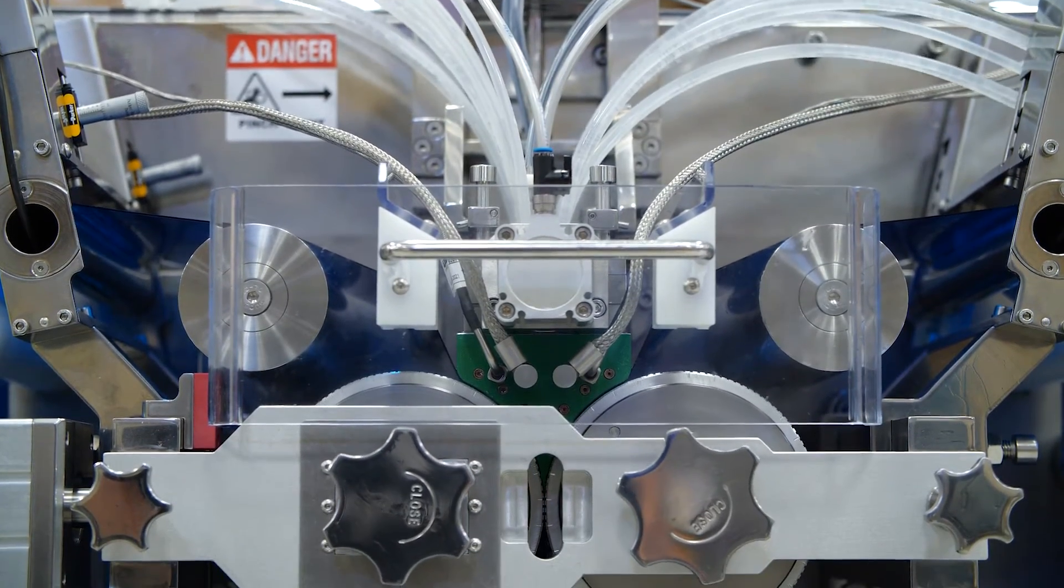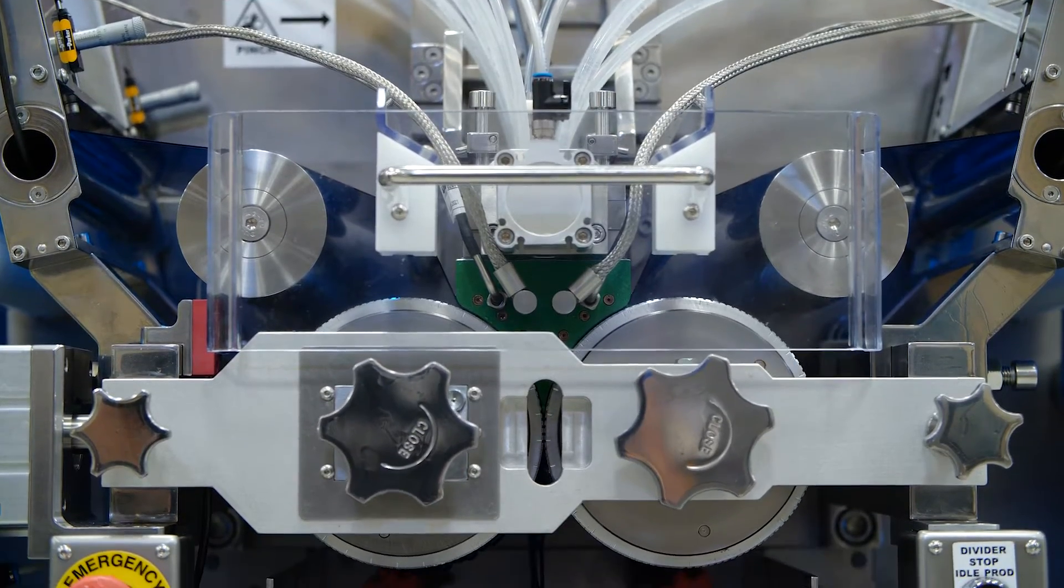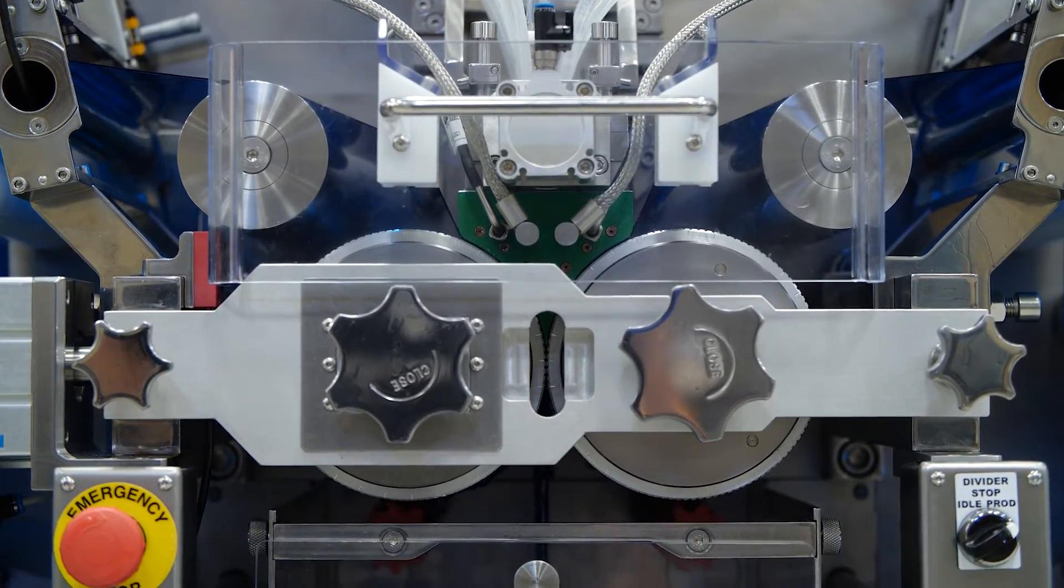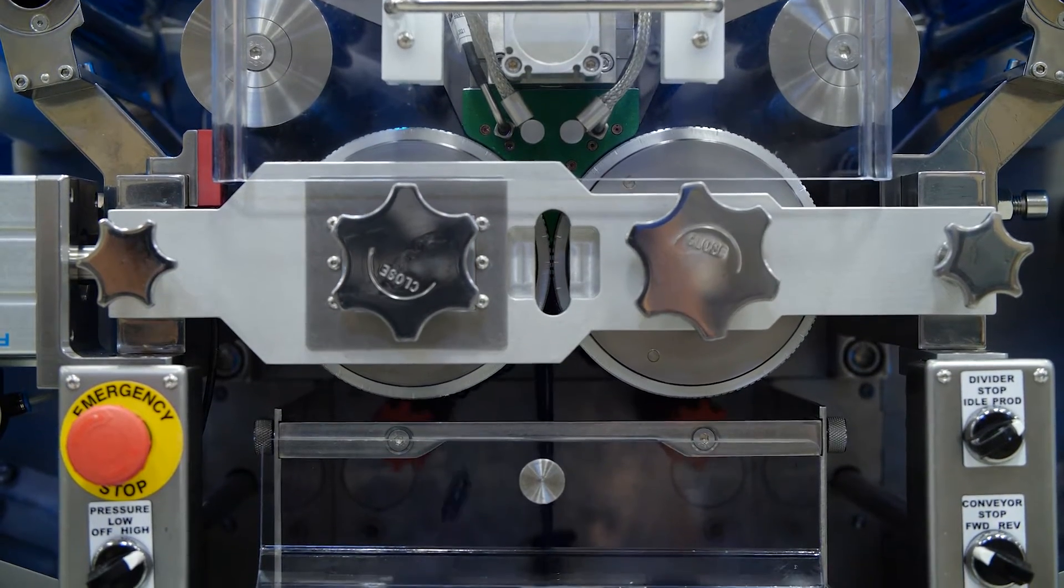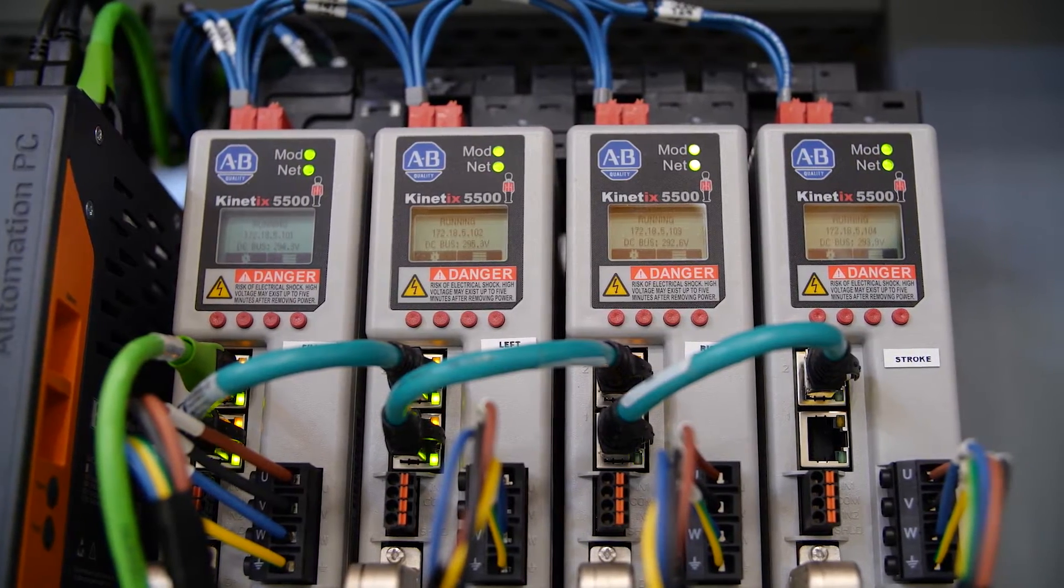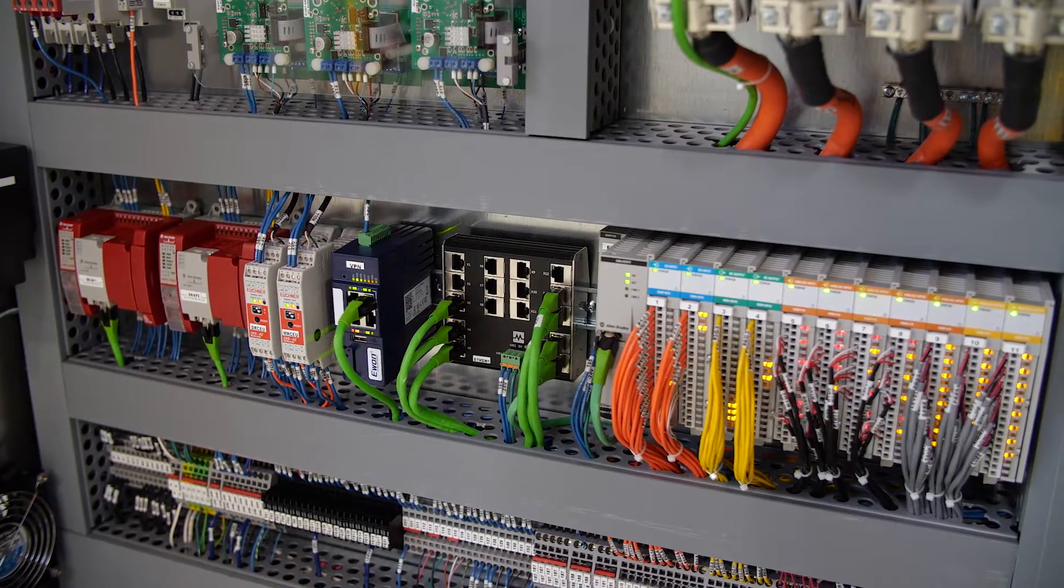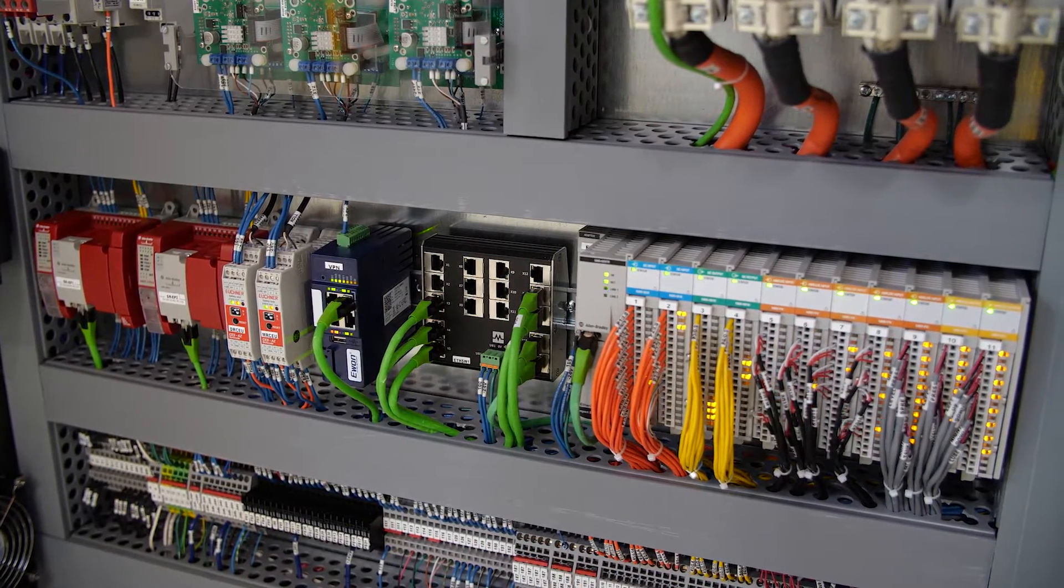The machine was engineered using in-house manufacturing and programming resources to provide customers with the highest level of quality and on-time deliveries. In instances where outsourced components are necessary, TechnoFar uses only the highest quality brands.